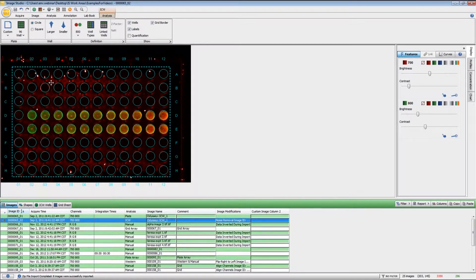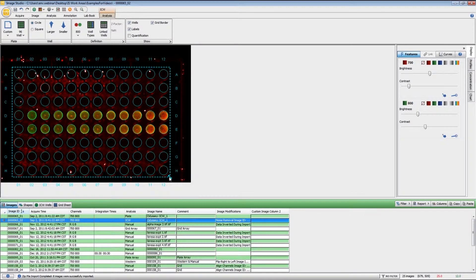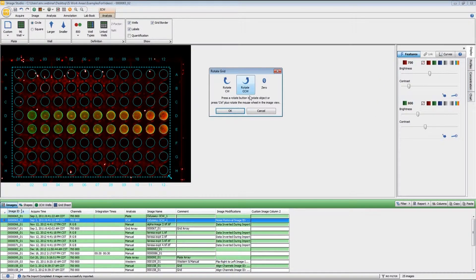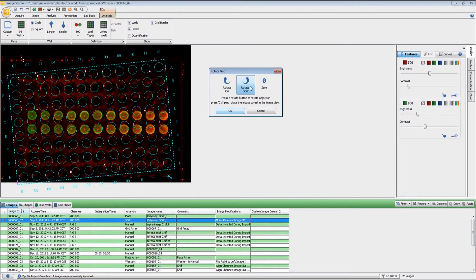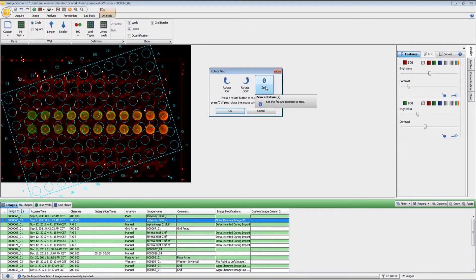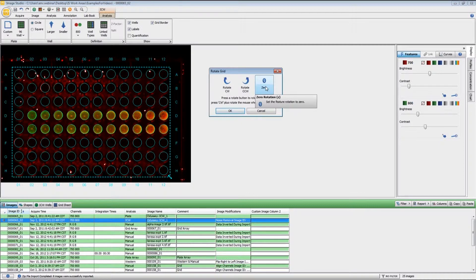You can also use the arrow keys on your keyboard to do some fine-tuning. Now if your plate was not properly aligned during acquisition, if you right-click on this, you can rotate the grid. You'll see that we have this grid rotation, and so you can rotate the plate to get it into the correct location. But this one is square, so I'm just going to leave this at zero.